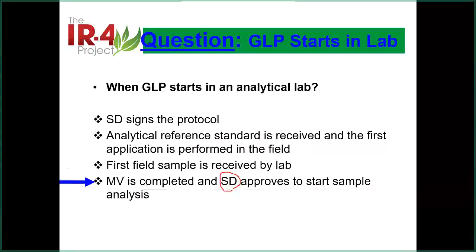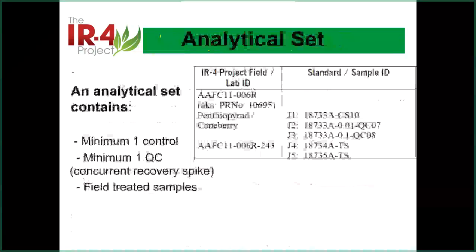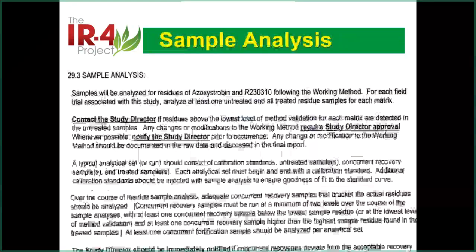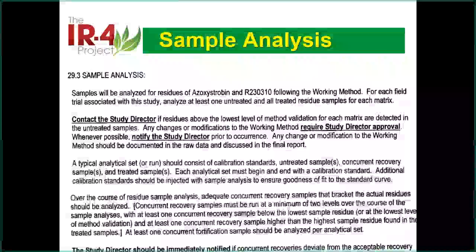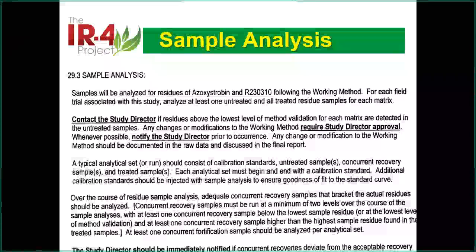Okay, let's just move a little bit more. Okay, we got that. Then we do the sample analysis. This is a big thing to talk about. There are some other things we need to say here: what is your analysis? For example, what is your R squared value?